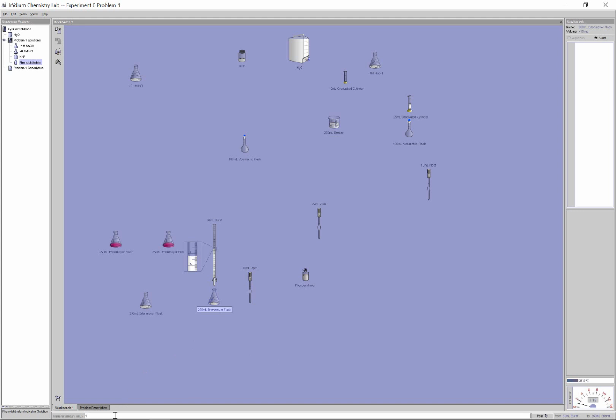So 21.22, let's add it in 1 mil at a time. So here we go. Pour it in 1, 2, 3, 4, 5, 6, 7, 8. I know it's probably going to be about 10. I made the concentrations here roughly equal. If I don't know that, I'm just sort of guessing and checking anyways. So it's going to be 8 right now here.